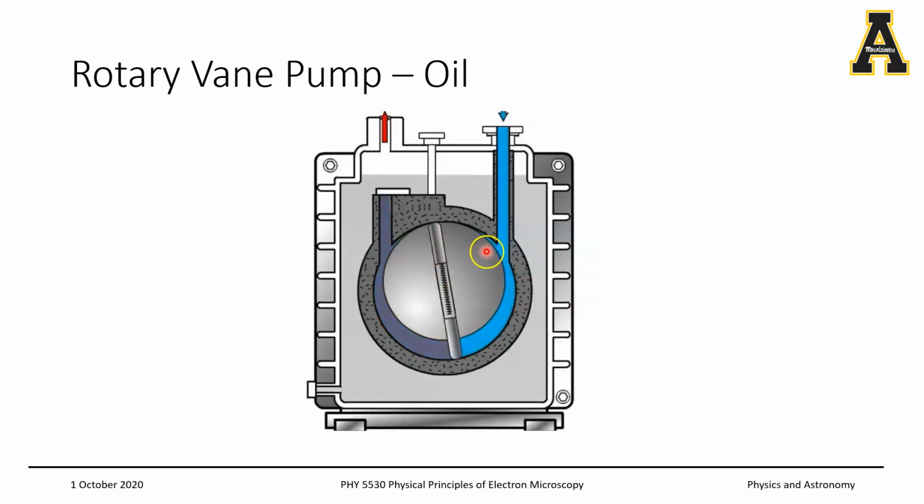And then one of the features of this kind of barrel-shaped circular cylinder pump is that there is a lot of friction between the inner wall of the pump chamber and the cylinder here. So you need to have that lubricated with oil. Usually these are hydrocarbon oils. They are standard and available in the market, and the oil has a very low vapor pressure.